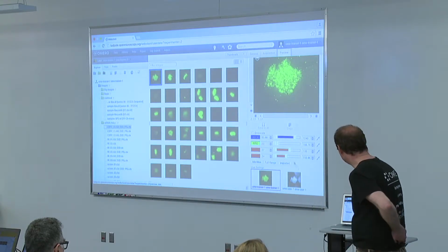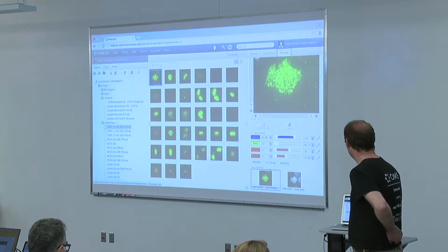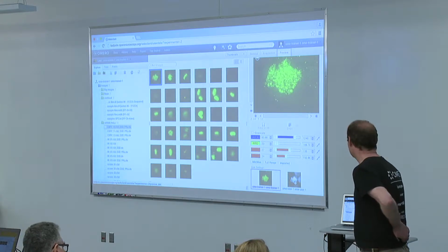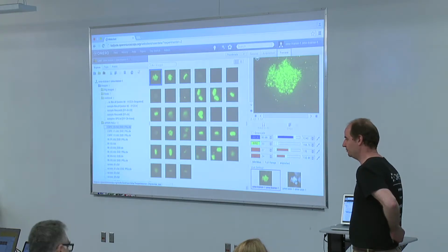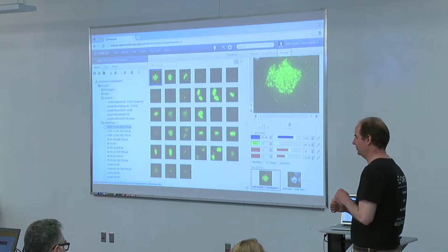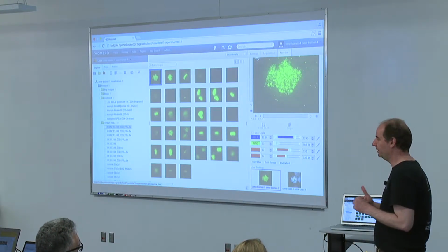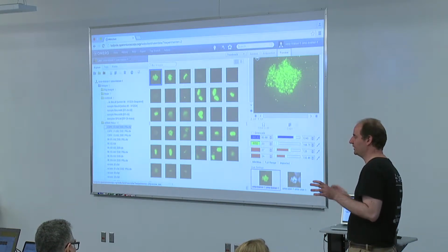And you can see here an interesting thing. I was fiddling with the rendering settings, if you happen to remember, and made all the images in the dataset green. This was all actions on my images, and I didn't care about other people. What in fact is happening there as well is that OME user 1 viewed my image as well, and he saved his rendering settings on this image as he wants. He likes black and white, and these are his rendering settings, meaning he doesn't change my original data, obviously, this is taboo, but he doesn't change my rendering settings either. We have both a separate rendering settings set with which we are viewing the same image.